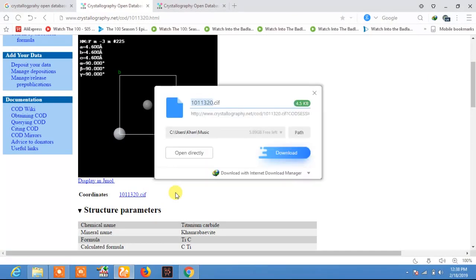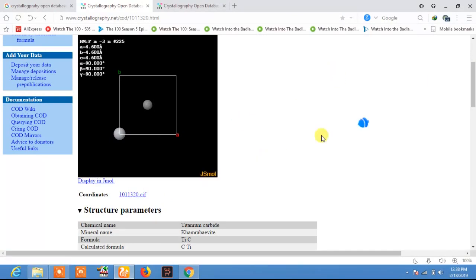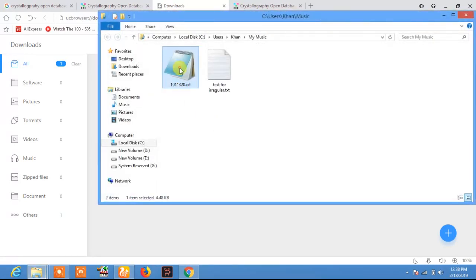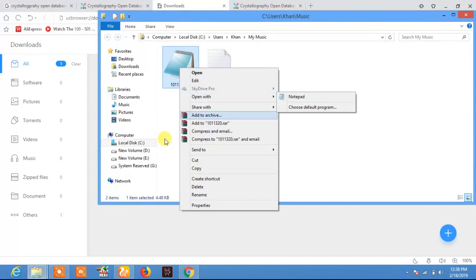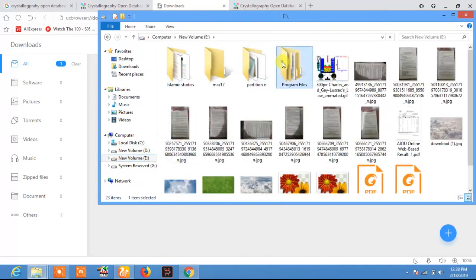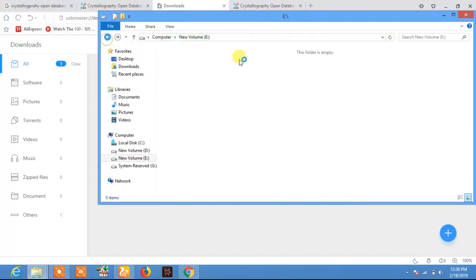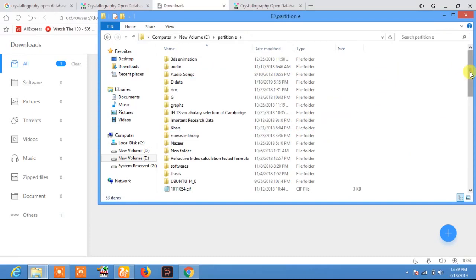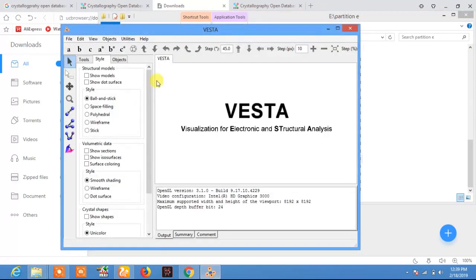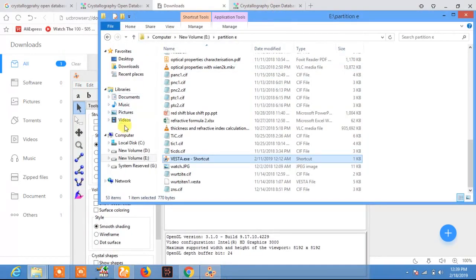If you want to download and visualize this crystallographic information file, you can use VESTA. If you have VESTA installed, open it, then go to the folder where you downloaded the file.